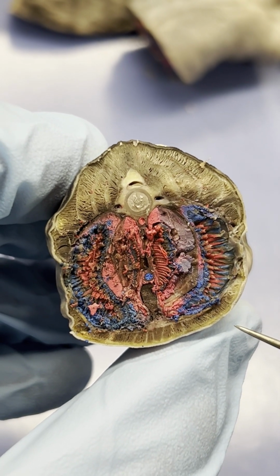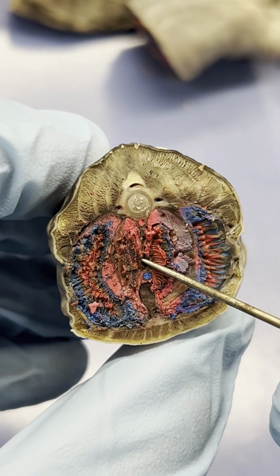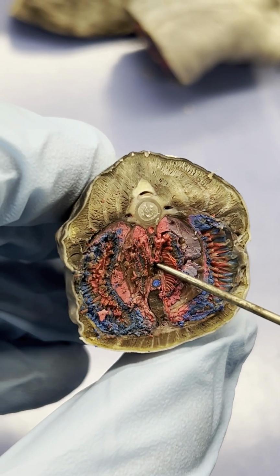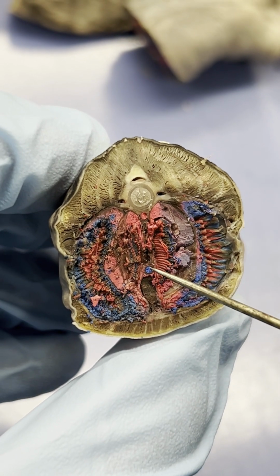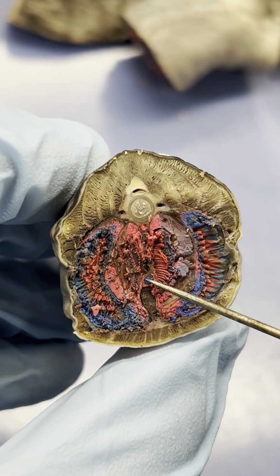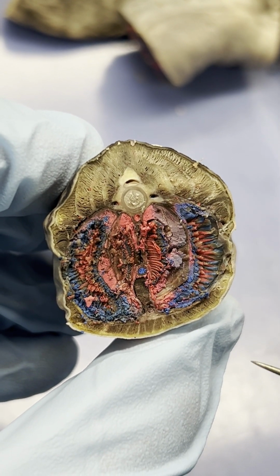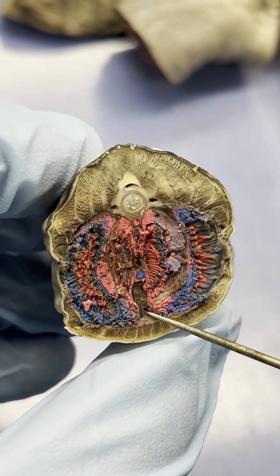I'm trying not to damage the specimen too much, but it's a little opening right here, again under the dorsal aorta. We have the pharyngobranchial tube, which is right here, another opening. Then we have the ventral aorta, this blue circular structure right here. The inferior jugular vein is actually going to be right here.